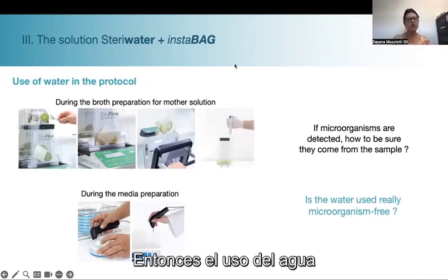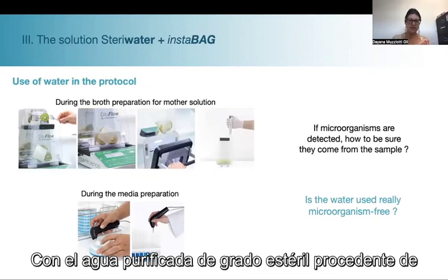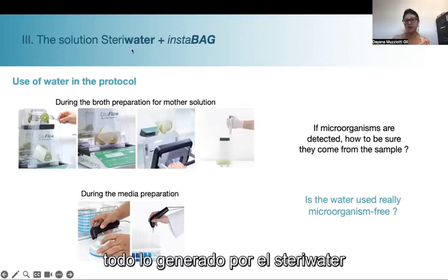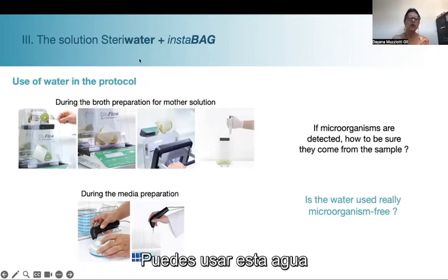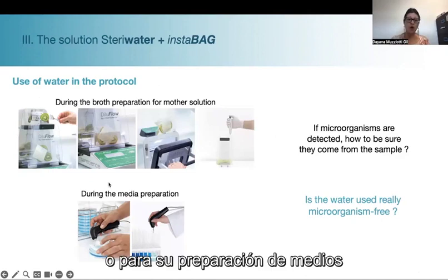Then, the use of water in the protocol. So, with the sterile grade purified water coming from or generated by the sterile water, you can use this water for your sample preparation as I show in this image, or for your media preparation.